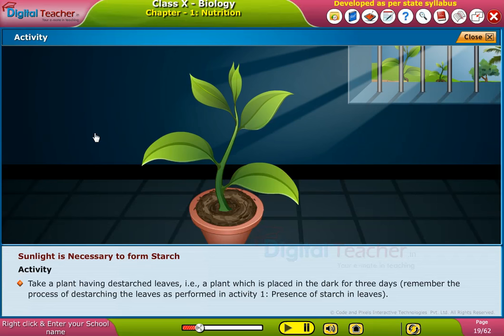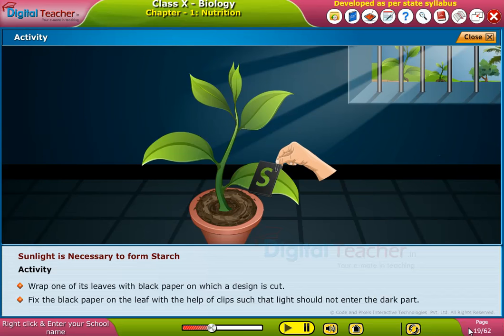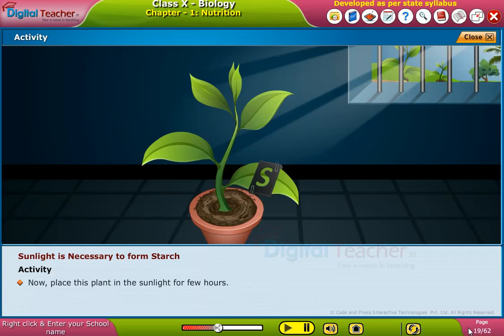Wrap one of its leaves with black paper on which a design is cut. Fix the black paper on the leaf with the help of clips, such that light should not enter the dark part. Now place this plant in the sunlight for a few hours.